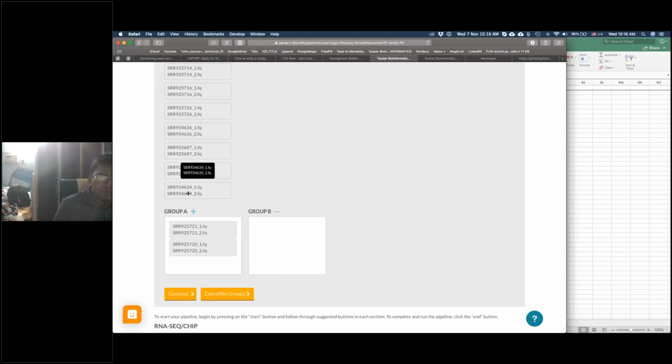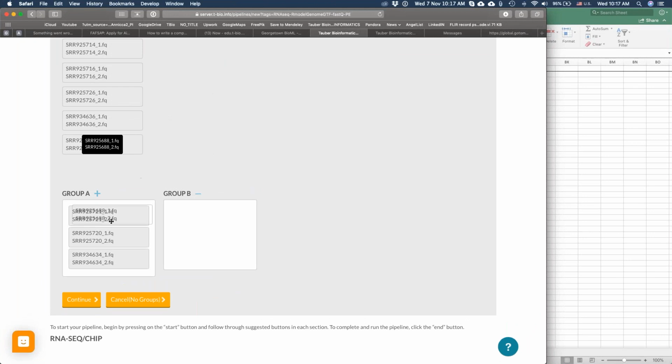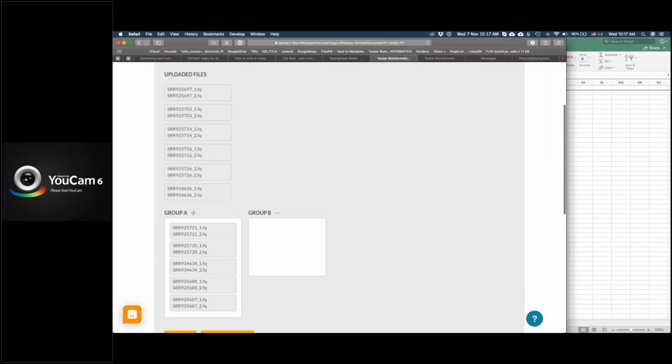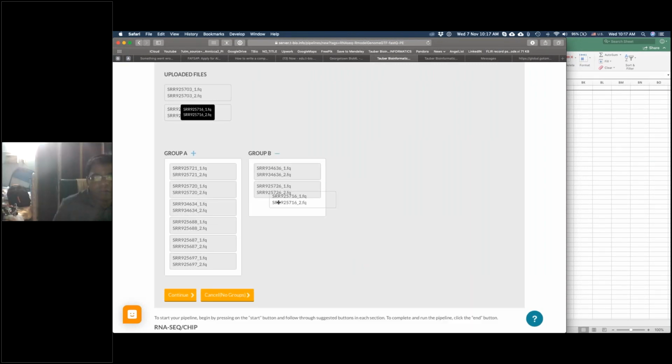634 is also non-malignant, and 634, 687, and 688, as well as 697. So this one. And the rest are going to be claudin-low.